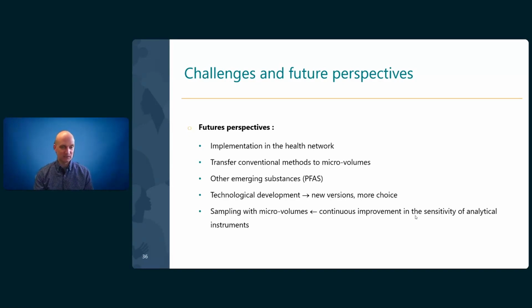On our side, and I suppose it's the case for other laboratories, we might need to transfer conventional methods to microvolumes. Historically, all our methods here at the CTQ have been based on conventional volumes, so thousands of microliters or milliliters of samples. But now it's possible to go to microvolumes. So this is a future perspective on our side, to move from conventional volumes to microvolumes.